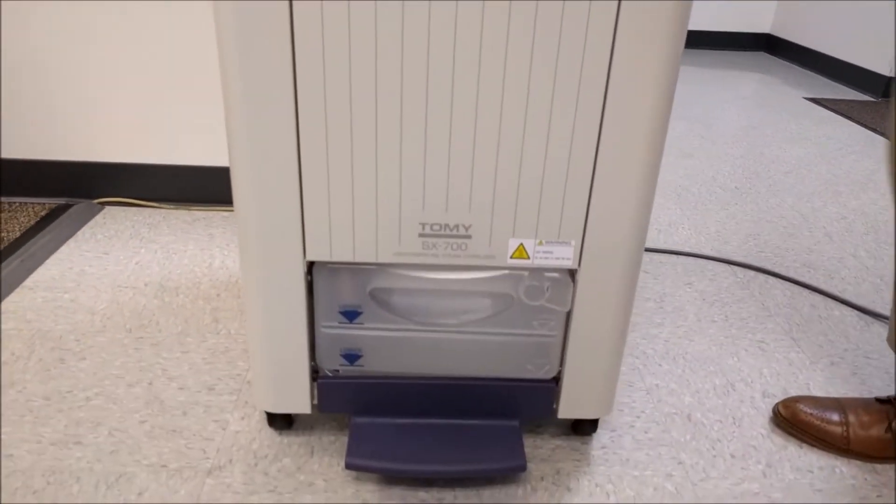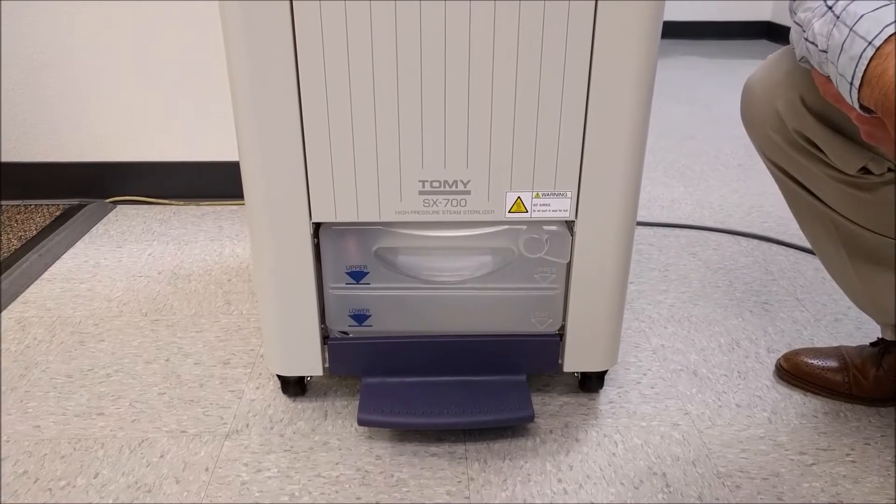The system is also equipped with an exhaust bottle, which allows there to be no plumbing connections at all.